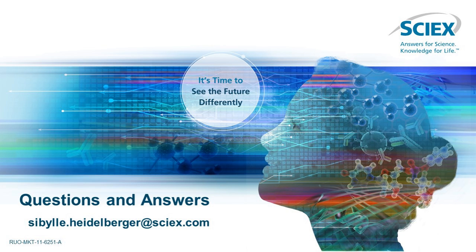And how long does it take to set up a swath method? And can the method be transferred easily between instruments? Oh, it's very quick to set up the swath method. I'd say basically 1 or 2 minutes just to set up a method. If you're doing the variable window, it takes a little bit longer, but even then, I'd say maximum 5 minutes to set up. And the methods can be transferred between X500B instruments. Yes, and that's easy enough to do. You just take the method, copy it over, and paste it.